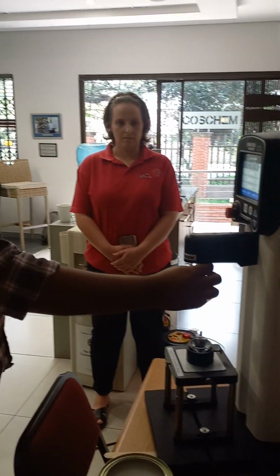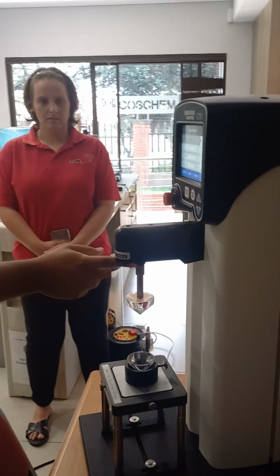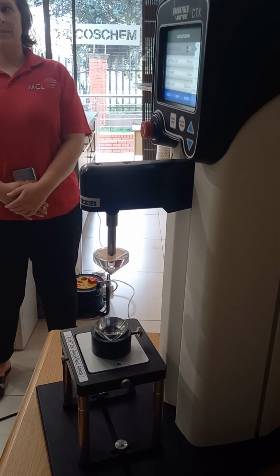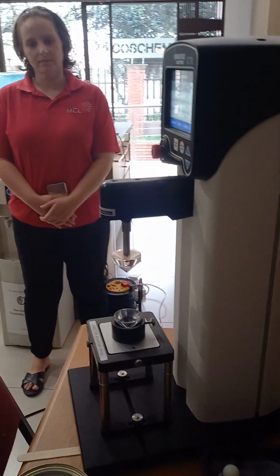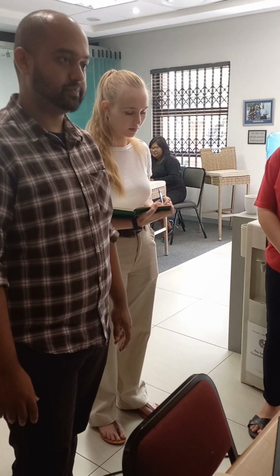Currently what we have connected to the machine is a 5 kilogram load cell. You have different ranges of load cells, right up to 100 kilograms, depending on the application. But generally 5 kilograms or 50 kilograms will cover a wide range of samples.